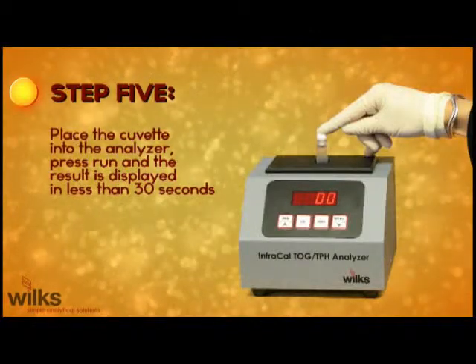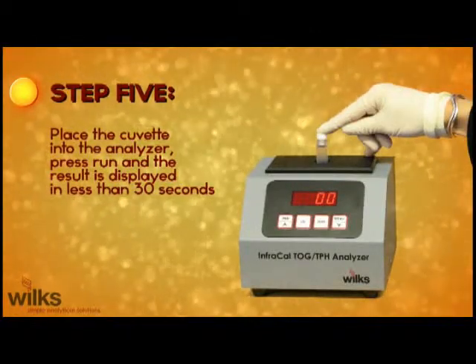Step 5: Place the cuvette into the analyzer, press run, and the result is displayed in less than 30 seconds.